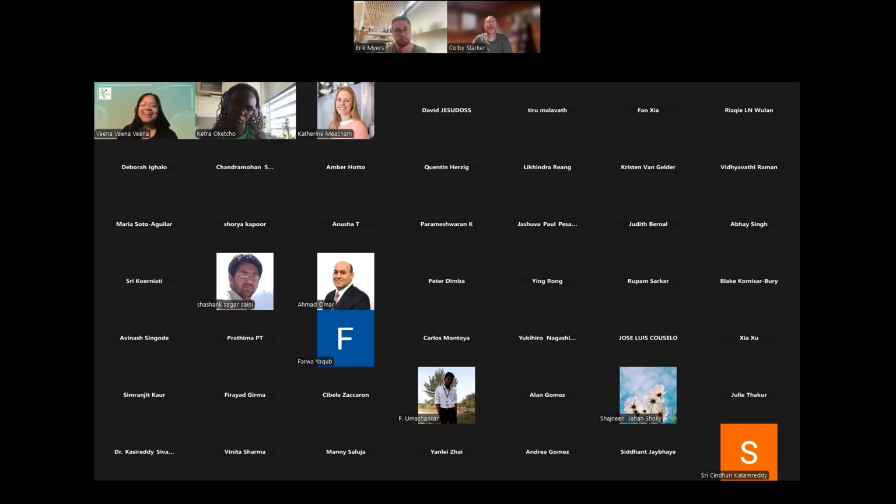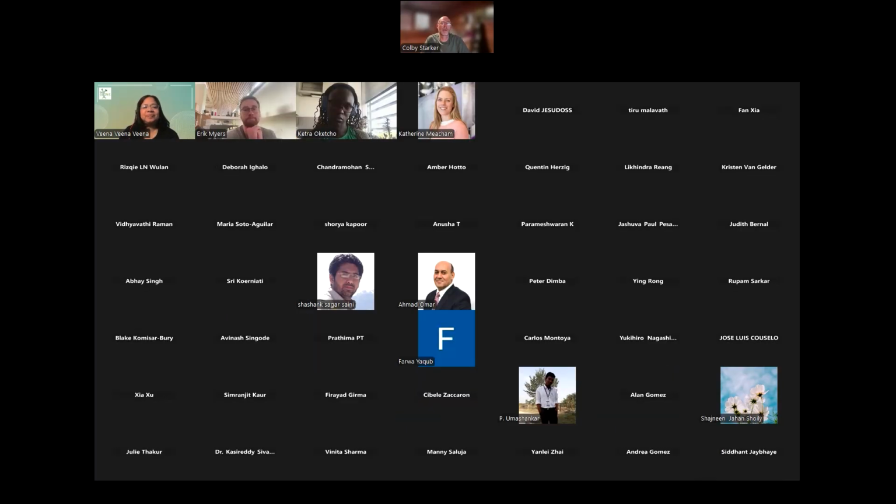Okay, I can go first because that way Erik can't use mine. I actually watched on Plant Gene one of these expert master classes, and Tom Jacobs was talking about this, and Tom highly recommended that you design your genotyping sequence primers and test them and sequence your products before you actually even design your constructs. We don't typically do that. Nobody does that, as far as I know, except maybe the people in Tom's lab. And I would say that is some extremely good advice.